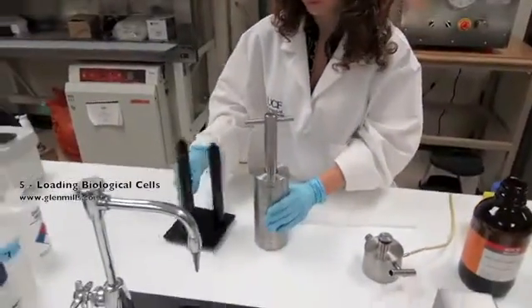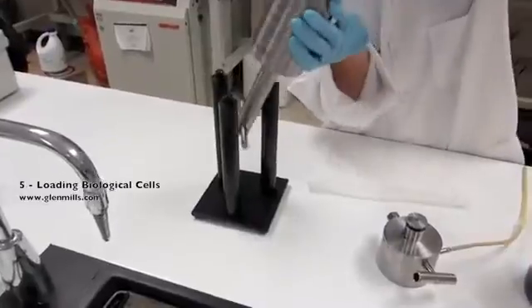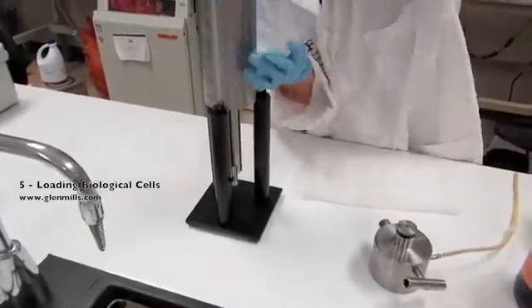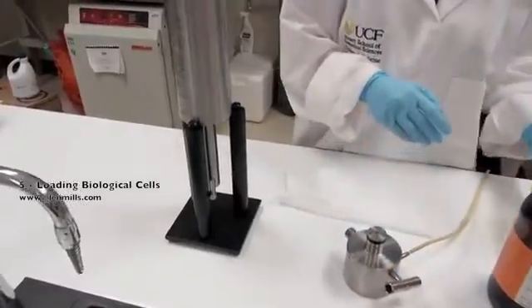Flip the unit over and place these two parts on the stand between the three posts. Fill the cell suspension until about one inch from the top.